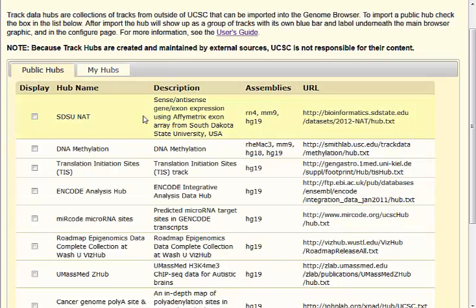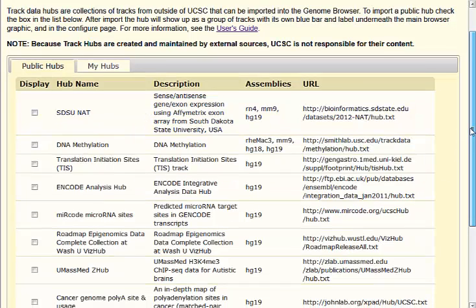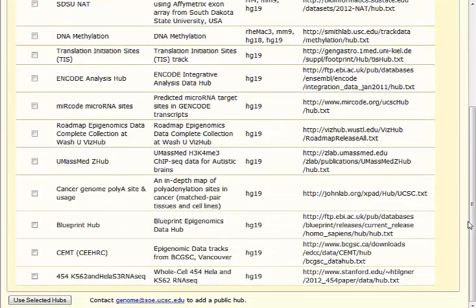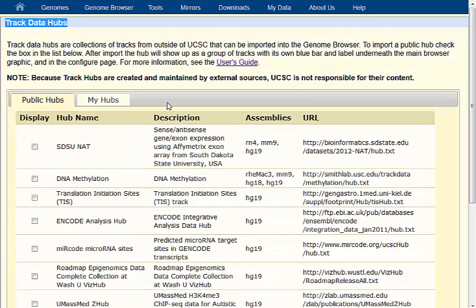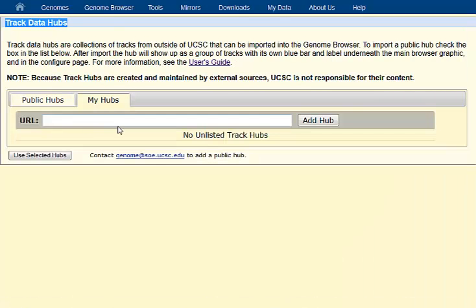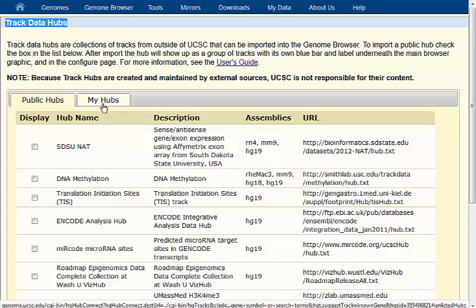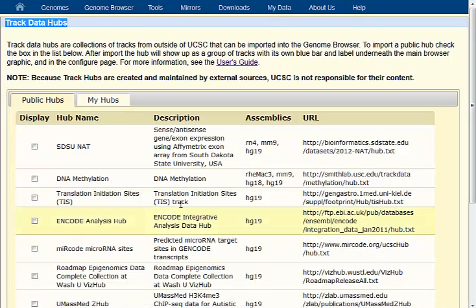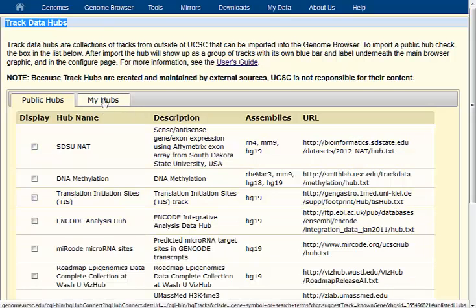But in addition to this, if you've got data from your lab — annotation data on any of the assemblies available in the UCSC Genome Browser — you can do the same kind of thing. You can structure your data just like these folks have, make it available on a server, and load it up through the My Hubs mechanism here. This will provide you with the framework of the UCSC Genome Browser without having to install one locally, and you can make that available to researchers you might be collaborating with around the world.